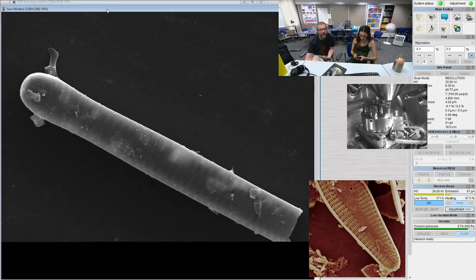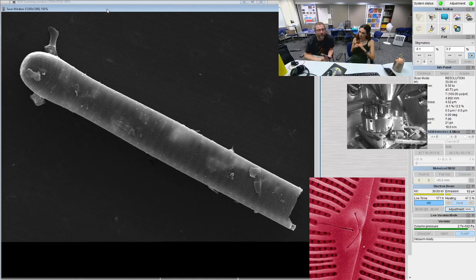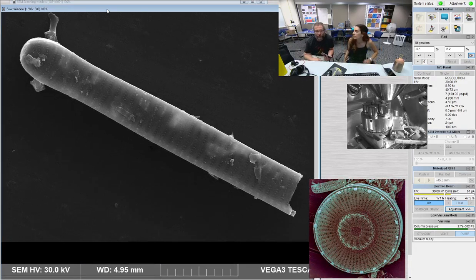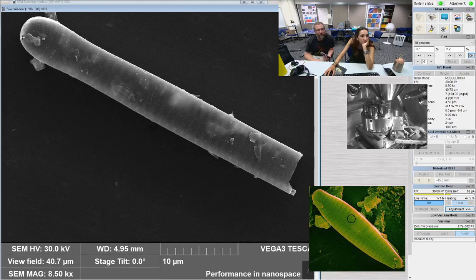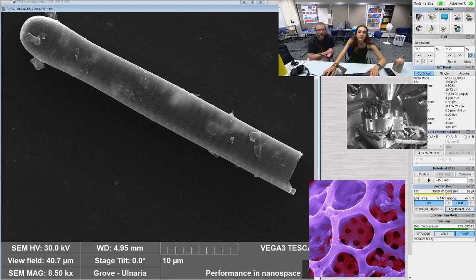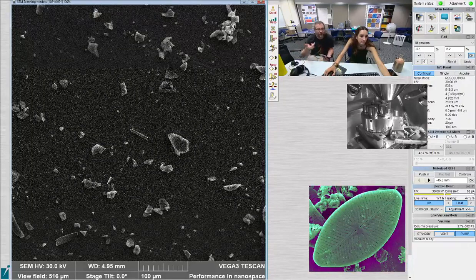I don't usually use it, and I've never really streamed using the EDAX because it's on a different computer, and that computer is not plugged into the internet at all. And I stream from this one, which is where the SEM is, but the EDAX is on a totally separate box, and it's controlled separately. But the two computers talk to each other when the SEM needs to send information to the EDAX. But I don't think I could actually showcase what's on the EDAX screens without just pointing a camera at them or something really rudimentary. So part of the reason why I don't do that is there's no way to showcase it. I can't even put it on Zoom because it's on a totally different computer. It's connected to each other, but they're not connected to the internet directly.